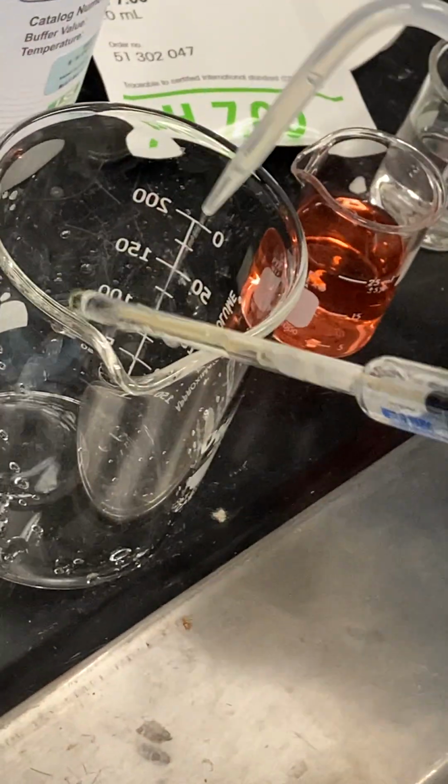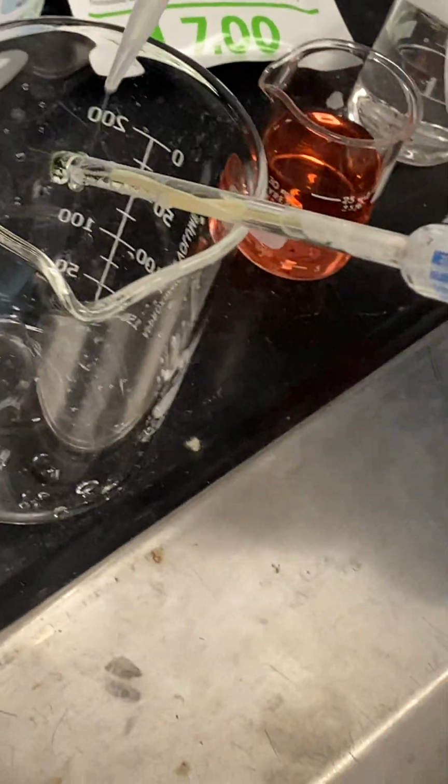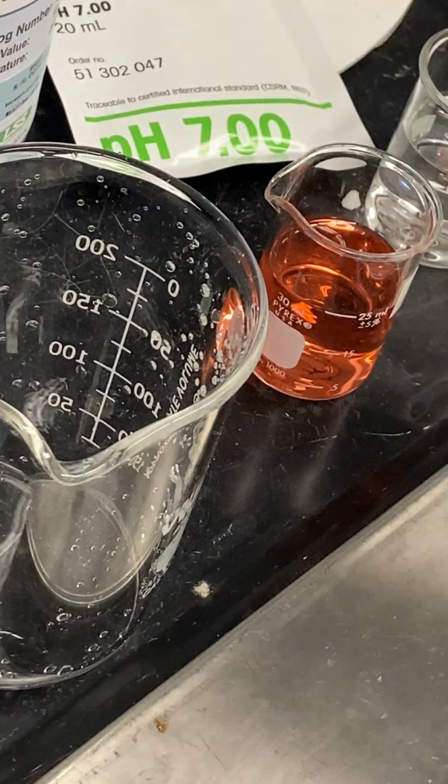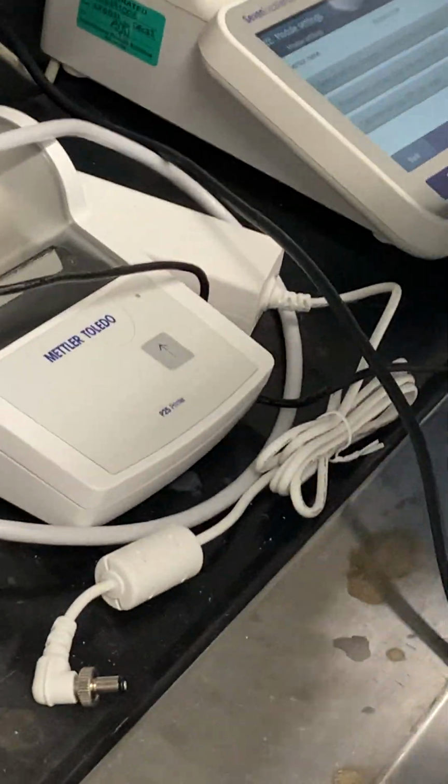So you're just cleaning it now. Yeah. But you could use some type of DI or distilled water for that, right? DI water is what's preferred. So let's go calibrate. Oh, actually, can you hit it for me? Thanks.